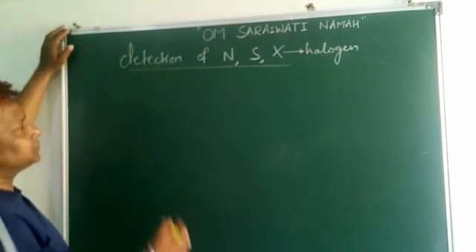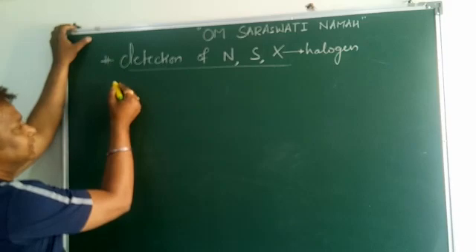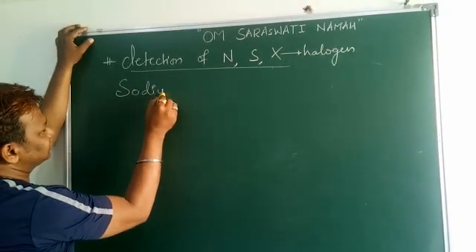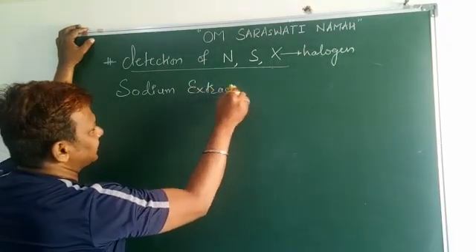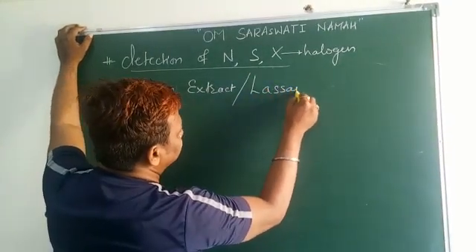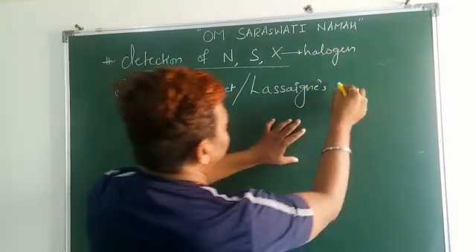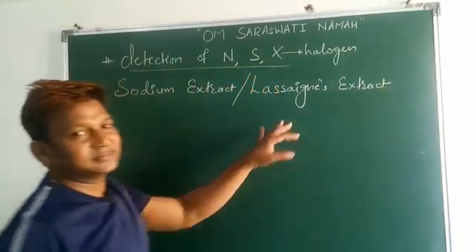For detection of these particular elements in the organic compound, first of all you should prepare a sodium extract. Please remember this sodium extract is also called a Lassaigne extract.